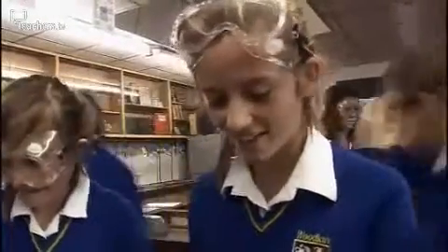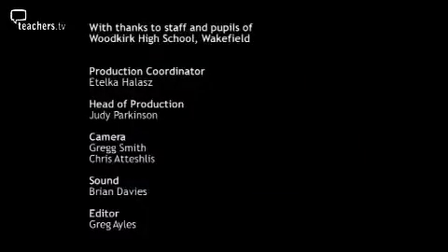What I liked about the lesson was changing the different colours in the test tubes. We're not just sitting around — we're doing experiments and stuff. We got the chance to mix different chemicals together with acids and alkalis to make a different colour. I think this will be really useful for them because they're going to go on next to study the pH of different sweets and try and look at whether sweets are acidic or alkaline, whether different sweets have different pHs. I think they've had a really good lesson here getting used to looking at the pH and what the different colours of indicator tell you. Thank you.